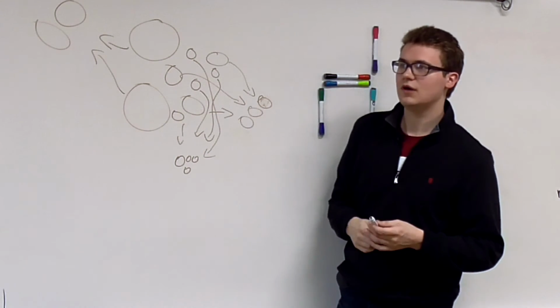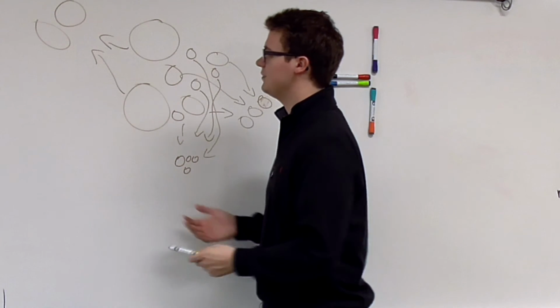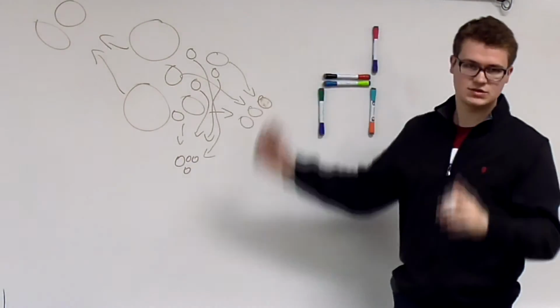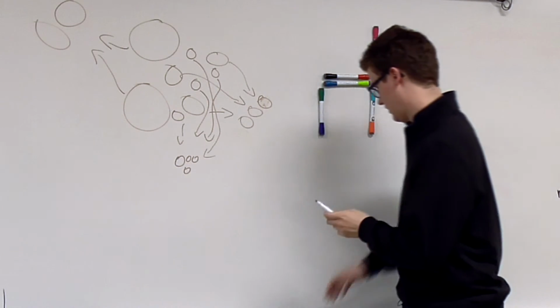You might also wonder, how exactly does this happen? Is there some method to get big molecules somewhere and to get medium and small ones separated? And there could be all sorts of different sizes. And the answer is yes, and here's a good way of how it looks.